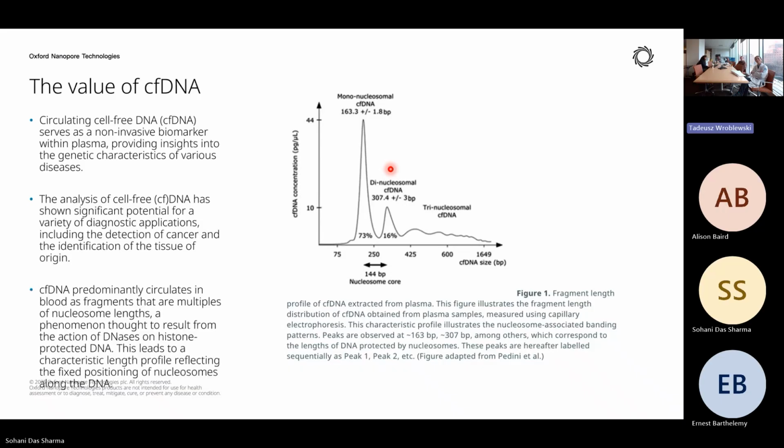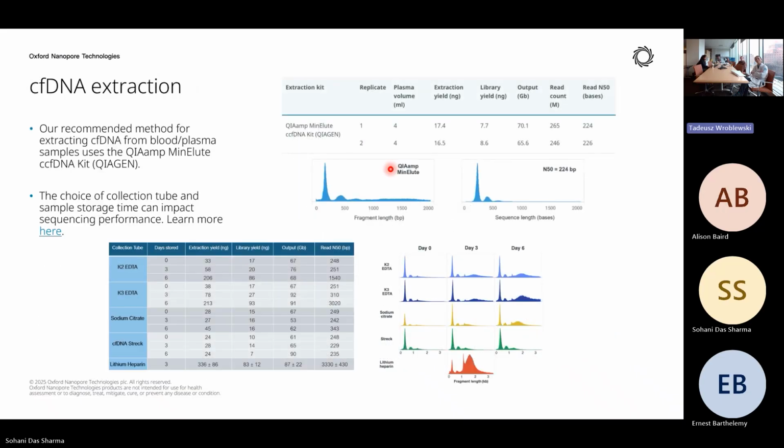We already talked about cfDNA. I think this extraction method is quite specific for plasma, not for CSF. Yesterday I was checking different papers. It was a very quick research from my side, and I would do more. I found a bioRxiv paper, I think submitted in 2025. Check their extraction method. It is completely different, and they did not follow our suggestion for making the library; they optimized it.